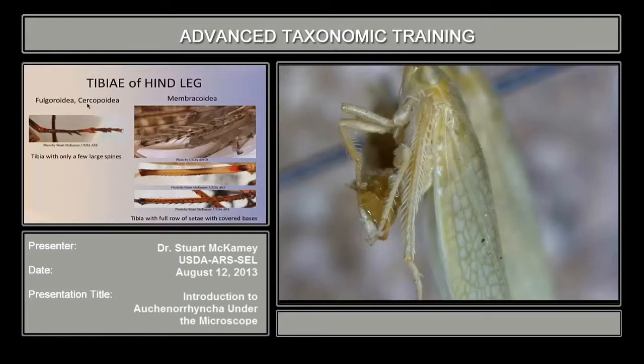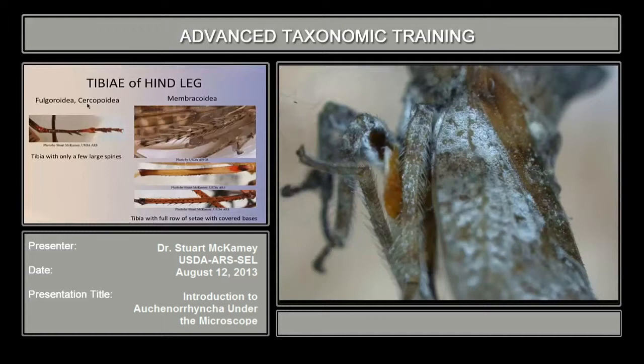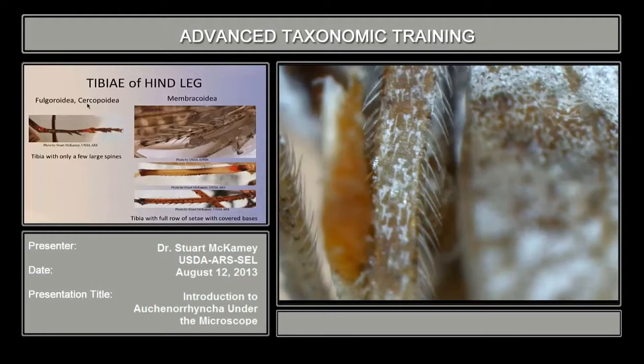This is the treehopper. Although the spines are smaller than in most leafhoppers, they still have setae with covered bases, as in leafhoppers. Here's the hind tibia — zooming up on that — these black-based setae are homologous to the basally covered setae in the leafhoppers. So these are the two families of Membracoidea: the leafhoppers and treehoppers.